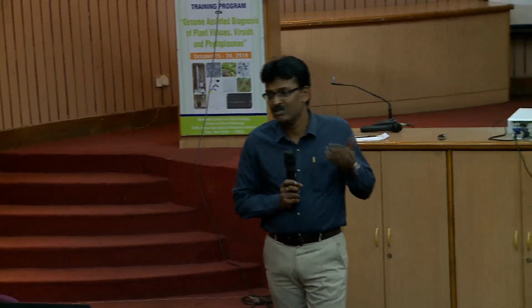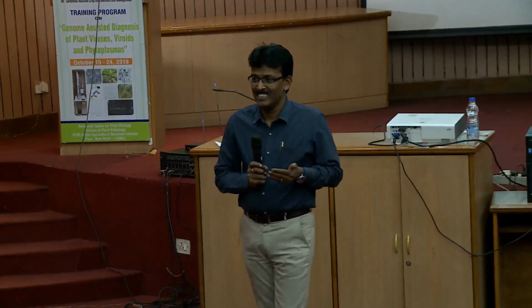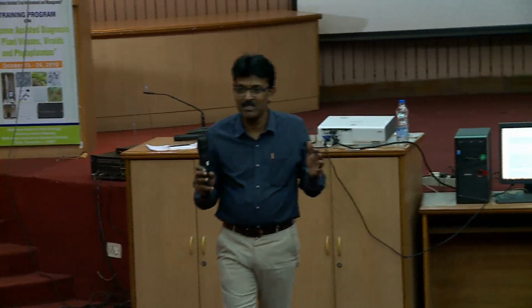I think this was explained from the very basics, the sequence analysis simplified. So I can make two interpretations: either you fully understood or you didn't get anything out of it. Anybody having questions, please identify yourself when you ask.